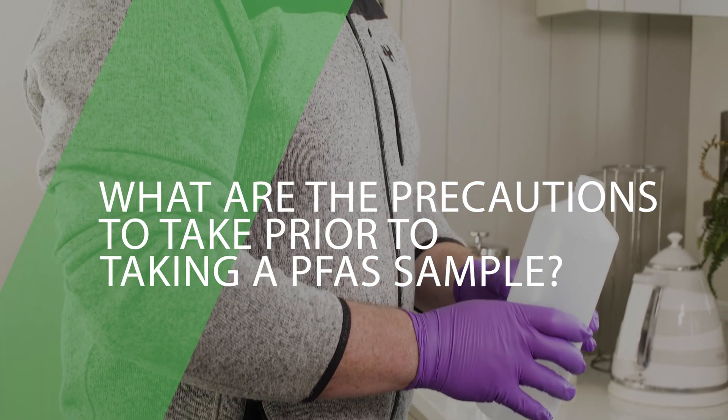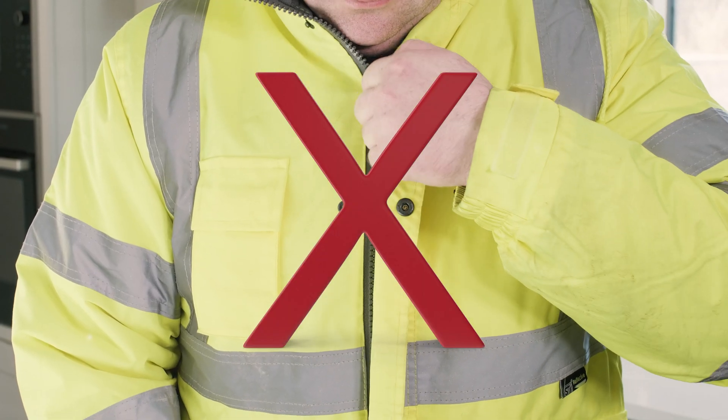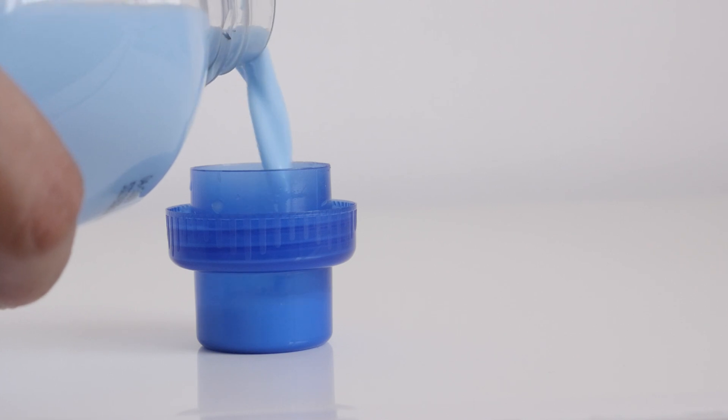What are the precautions to take prior to taking a PFAS sample? 1. Clothing that is water resistant, such as high-vis jackets, cannot be worn when sampling for PFAS compounds. Ideally, wear a coat that is not washed with fabric softener.